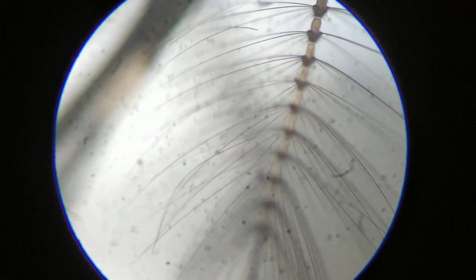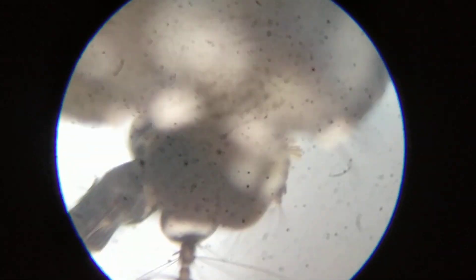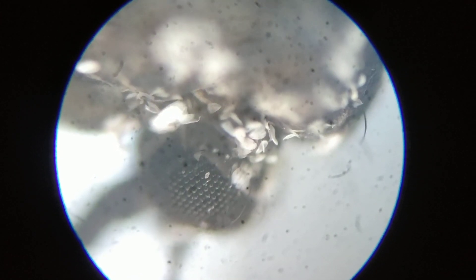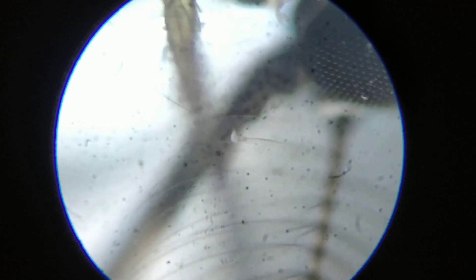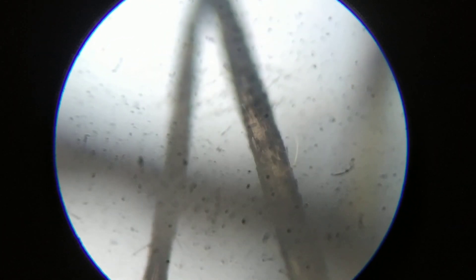Once again, I'm showing you these feathery parts. The lenses are very clear. These are the legs, as you can see. It has barbs or hooks to attach itself to the dead skin cells of its host.